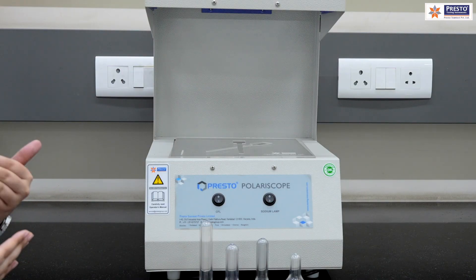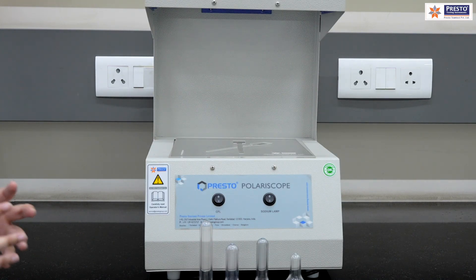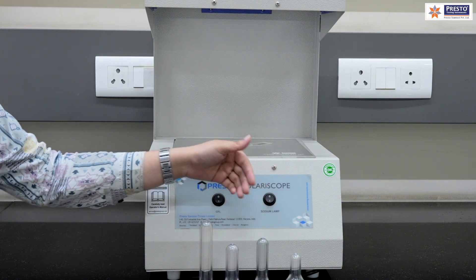Each color depicts a certain level of stress in the sample. Lighter colors depict less stress and darker colors depict more stress. This is how we analyze the sample — I will be taking an optimum and a non-optimum sample.